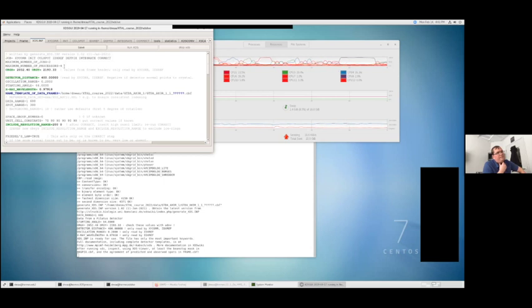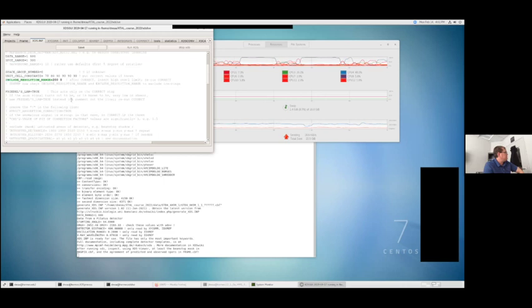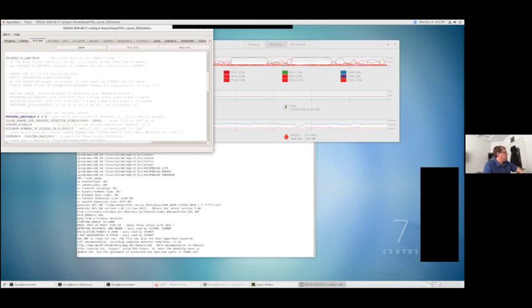Most of the time, when I collect a data set, I try to make sure that the entirety of the resolution spots that I can see, and therefore would anticipate collecting, are within the edge of the detector with some room to spare. And so most of the time, I would be fine with a trusted region of 0 to 1.0.